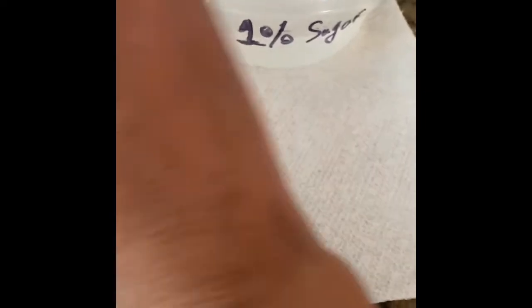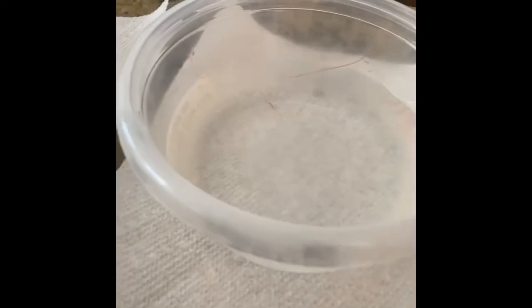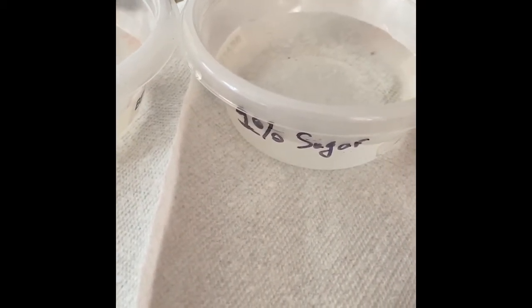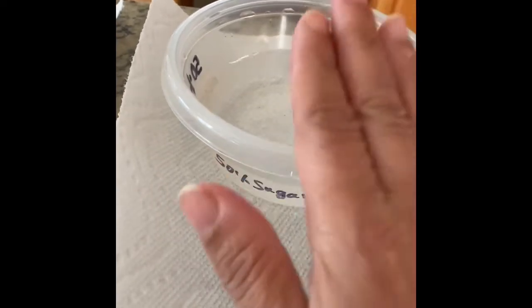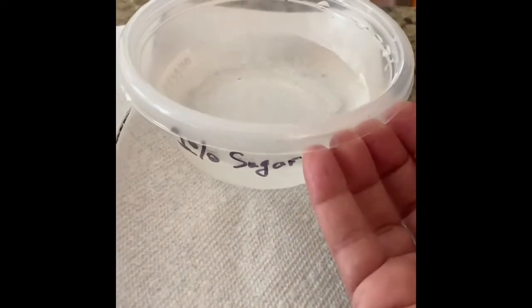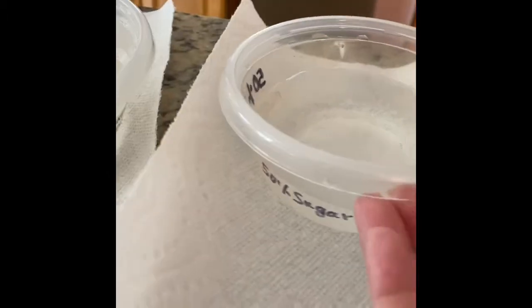This beaker is where we are going to study the diffusion of starch versus iodine. This is 1% sugar over here, which means 1 gram of sugar to 100 milliliters of water. And this is 50 grams of sugar for 100 milliliters of water, and we put 200 milliliters in each. This is only water right now, 200 milliliters of water, 200 milliliters of this sugary solution, which represents 1% sugar, and this is 50% sugar.